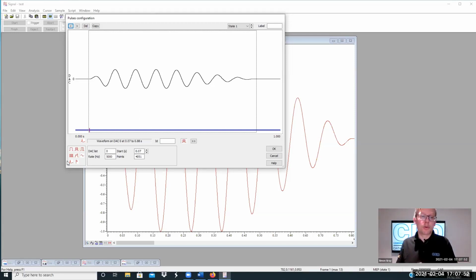It could be square waves, ramps, sines generated from this palette too. But as you can see, if I can generate the waveform within Signal using the virtual channels for a script, or even import that same waveform from elsewhere, I can add it to the output.